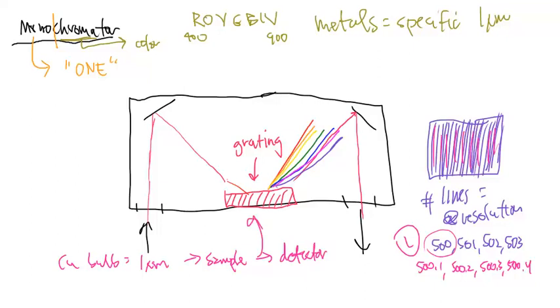And I know that the bulb typically does a very good job providing a specific wavelength that needs to be measured. But just in case it needs to be cleaned up, just in case there's interferences, because you've got to remember this thing is kind of outside, there's extra light that might be given to the sample or to the monochromator that might reach the detector, and you want to filter out all of that.